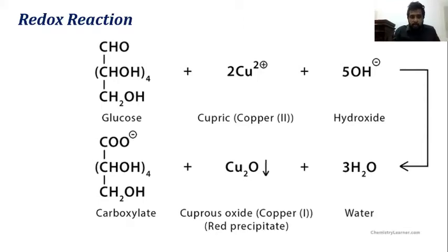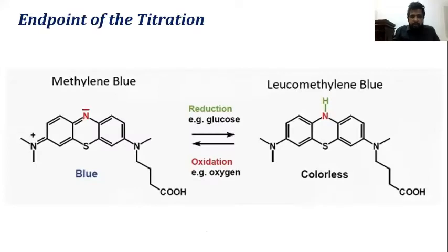Okay, and yes, then this is the endpoint. Methylene blue will convert into leucomethylene blue, and as our demonstrator explained, at the endpoint you have to observe the bubbles. You have to observe the color of the bubbles. At the endpoint you will observe very clearly the color of the bubbles will turn colorless. Before that, the color of the bubbles is blue because of this methylene blue.